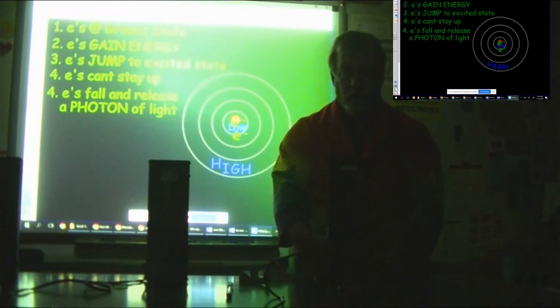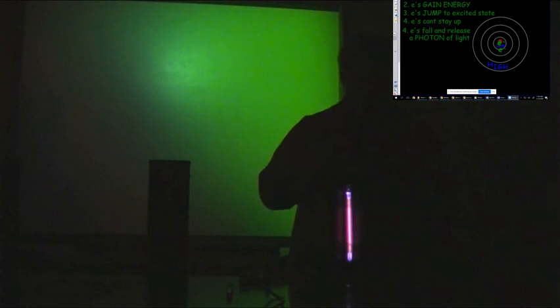For our last gas that we're going to put in here, we're going to use some argon. Here's our argon without the glasses and our argon with the glasses. Again, we should see a nice spectrum. Each one of these should be different for all 6 of the elements. This is how we do spectral analysis of so many different kinds of chemicals here on Earth as well as out in outer space.